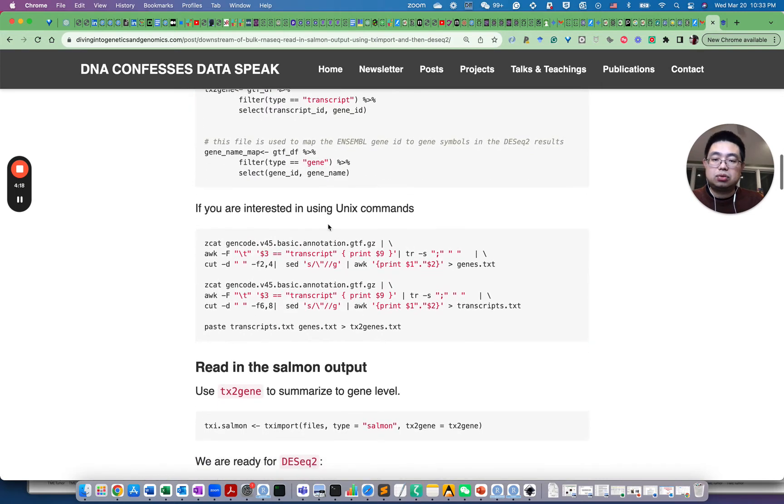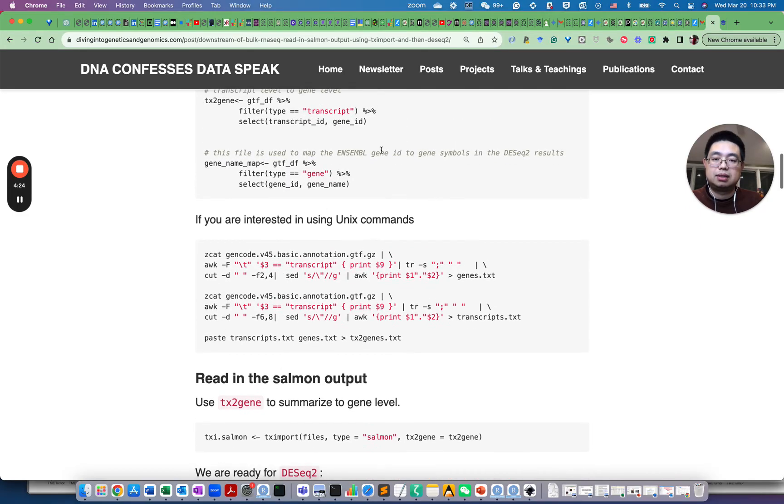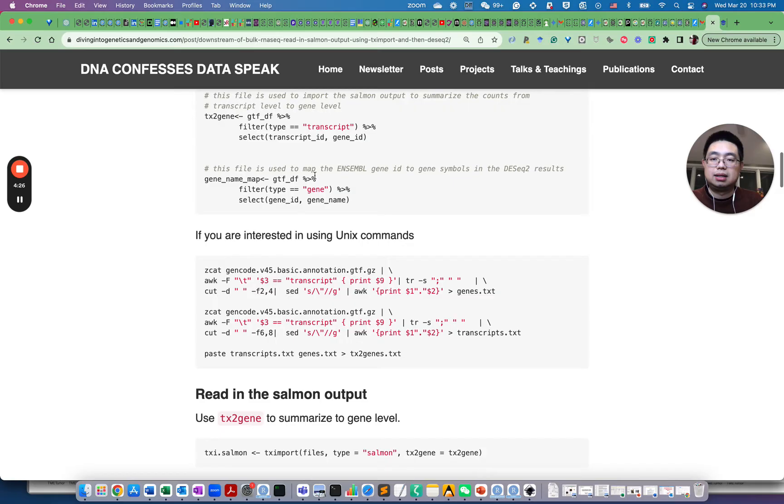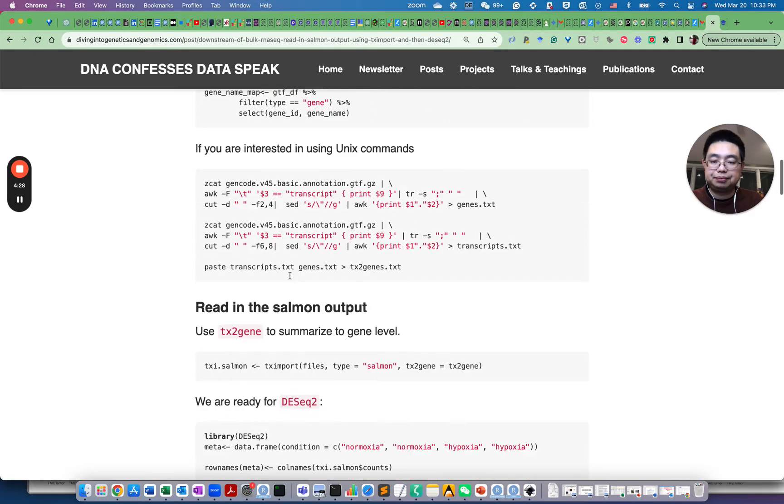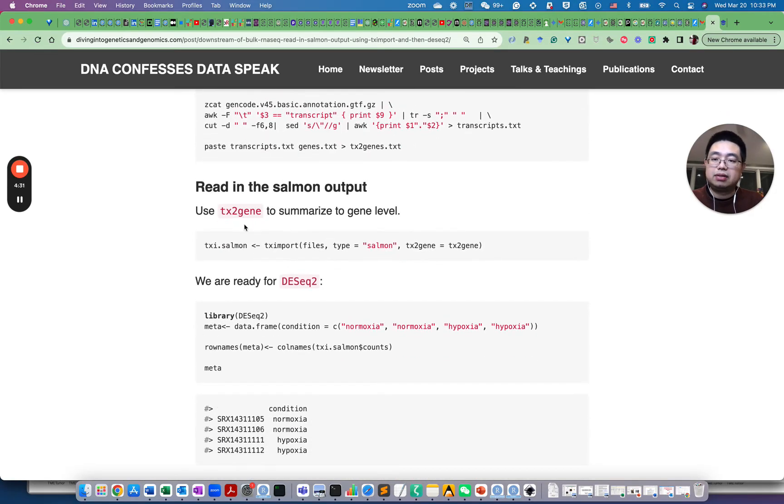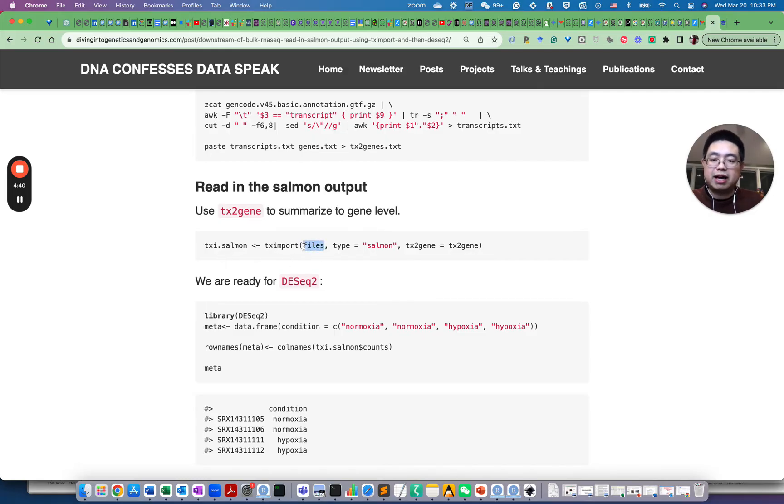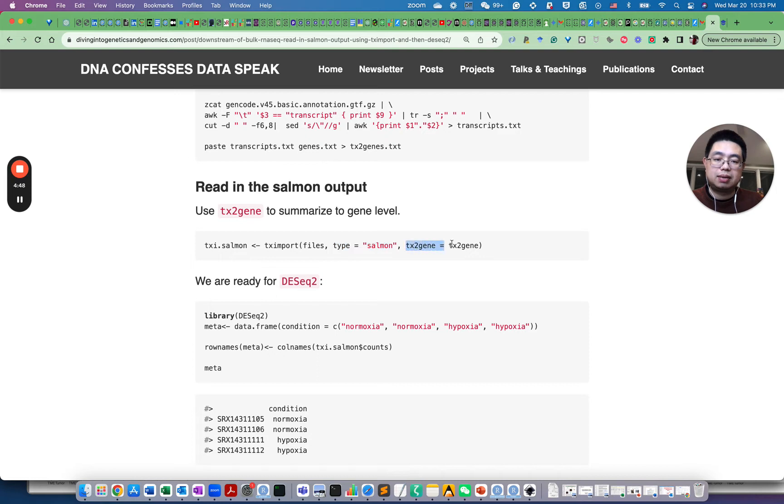I also show you how to use Unix commands to actually prepare this TX to gene file, but you can just follow the R version. Now that we have the TX to gene file ready, now we can read in the .sf quantification file, so use the TX import function files, essentially the file path for the .sf file type equals to Salmon and then specify the TX to gene file we just prepared.